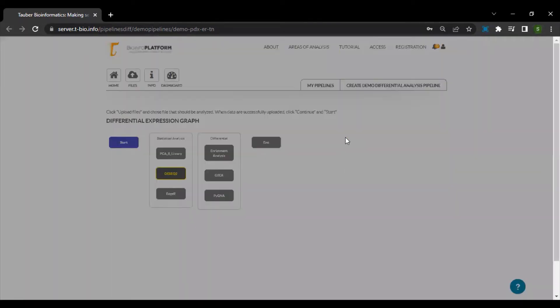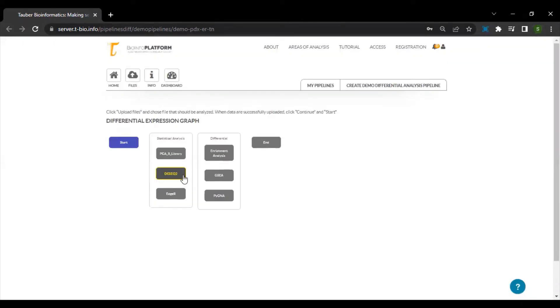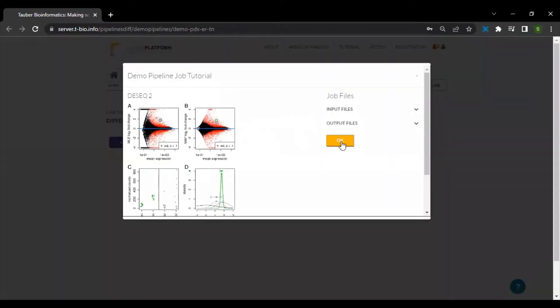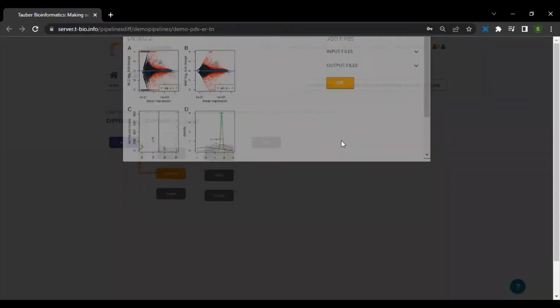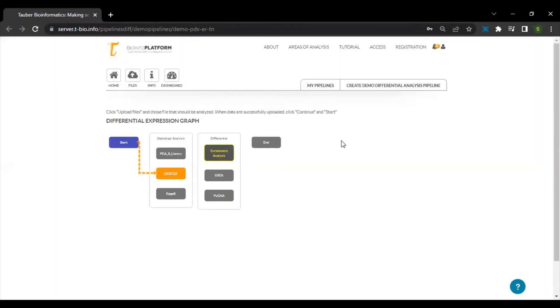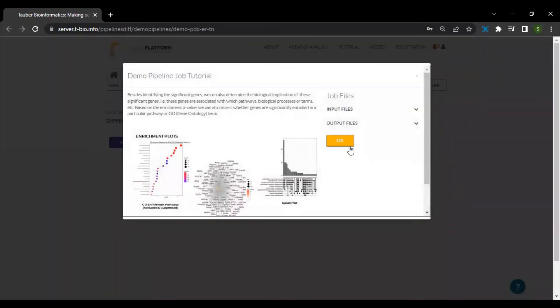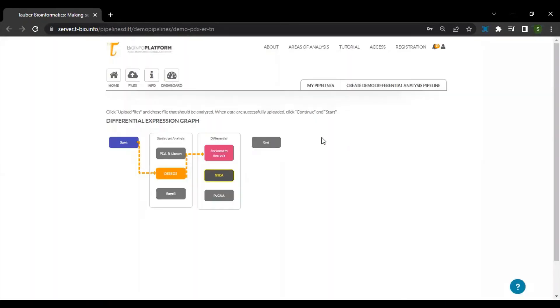This is followed by the DSEC2 for differential gene expression analysis of RNA-seq data. Besides identifying the significant genes, we can also determine the biological implication of these significant genes using the enrichment analysis and GSA algorithm.